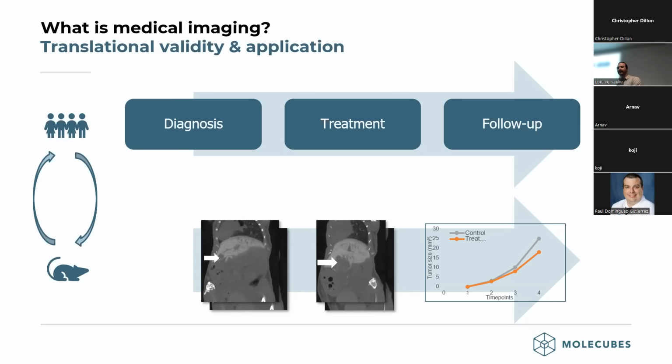However, in a preclinical setting, imaging is more used in a volume setting, in the sense that you want to use multiple animals to gain statistical relevance, to track a certain known condition. This could be the tracking of your disease model in the animal to validate your animal model, to validate a specific cell line.